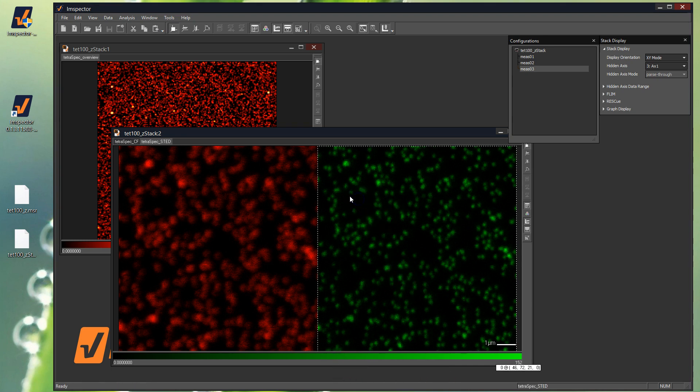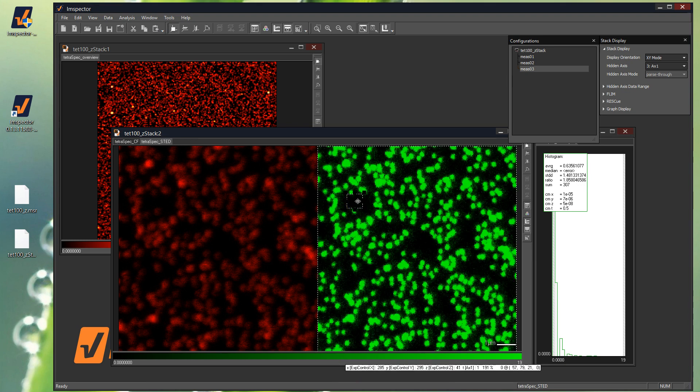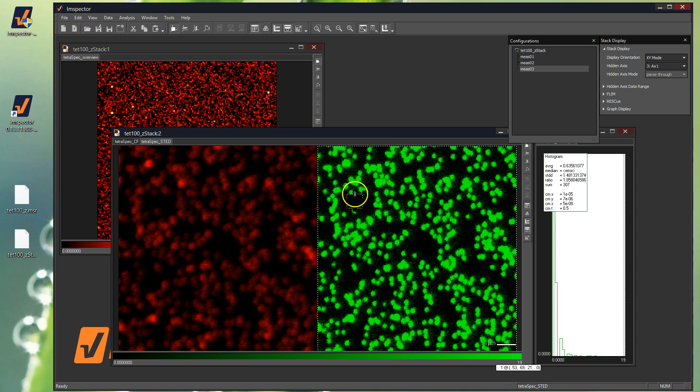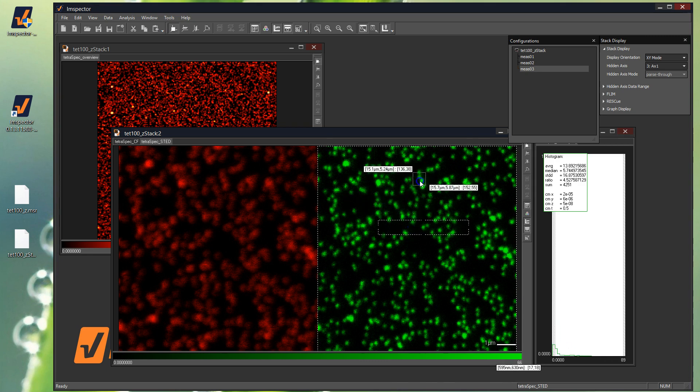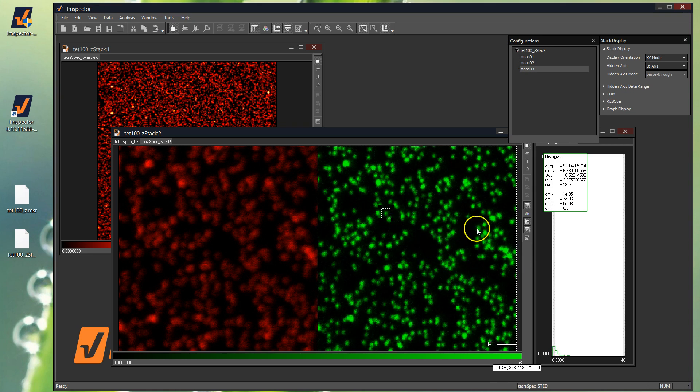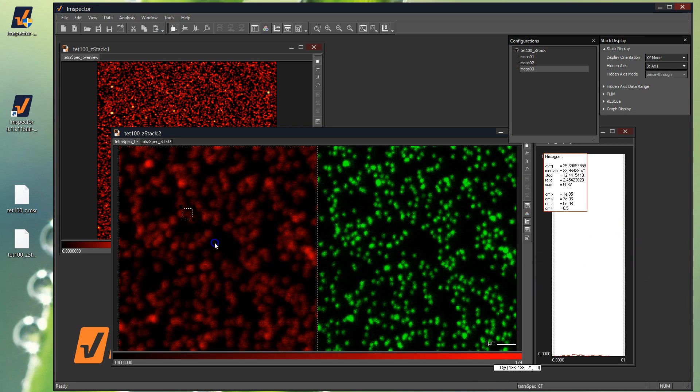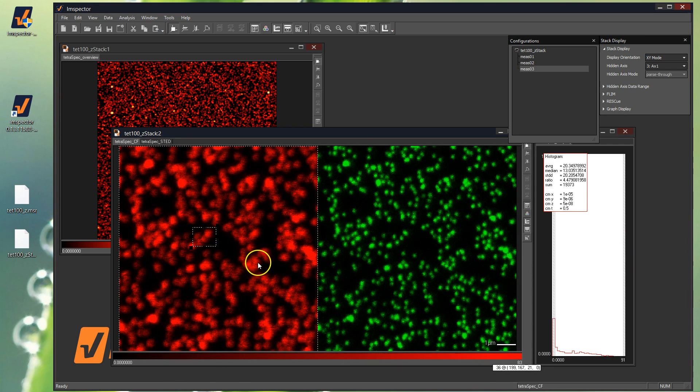And let's go ahead and see if it works. So F9, if I drag and drop a little window in here and hit F9, it auto-scales to whatever I've got in it. It has little adjustment boxes which are black, or given that they have a black background it's a little bizarre, but you can just about get them and change the window and hit F9 again, it will auto-scale there. So you can kind of pick the bright ones if you want to auto-scale to those. Or hit F9, or you can pick a dim area and auto-scale to that. So you can use that F9 auto-scaler to change where it scales to.